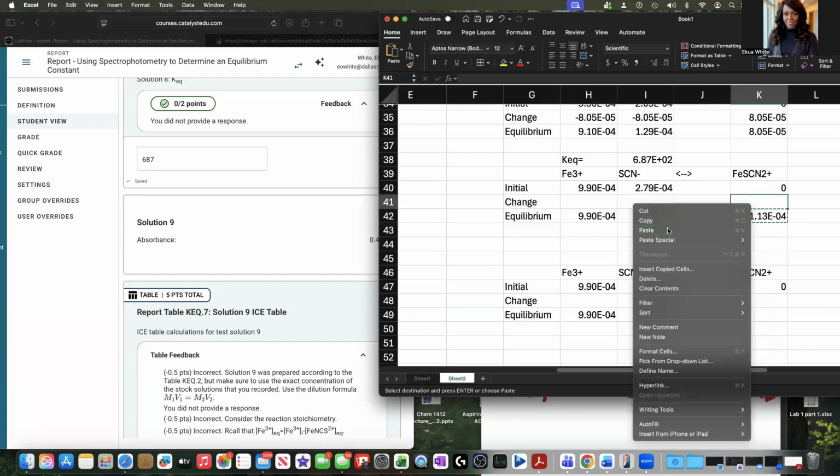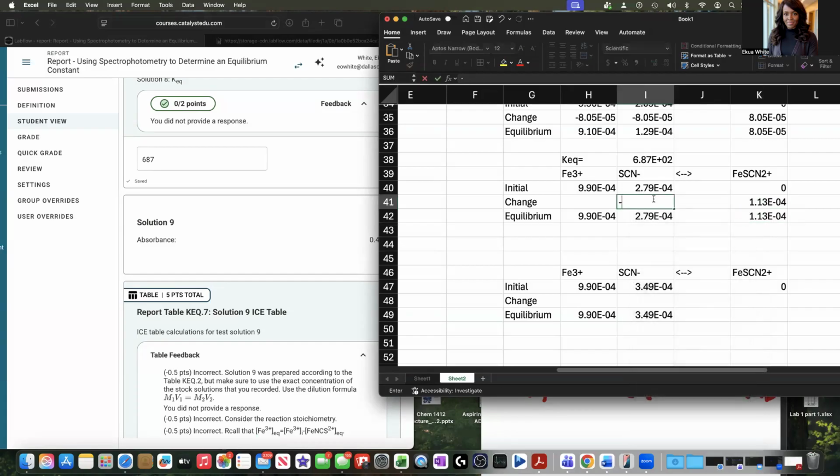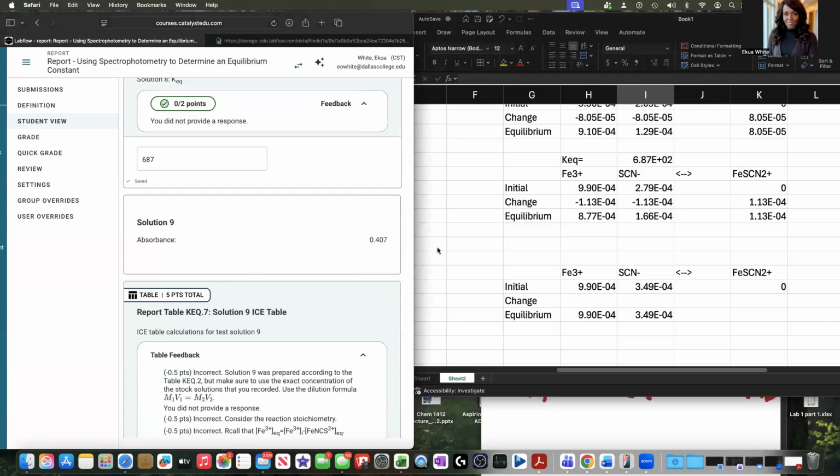Guys, I wrote this down so that it makes it easier for me, just in case you're wondering how I'm doing this fast. I have the numbers written down. I'm trying to go with the same pattern so I'm not overthinking the process.